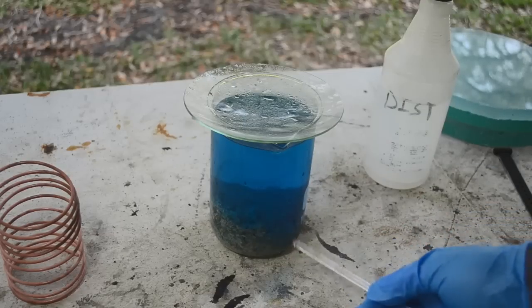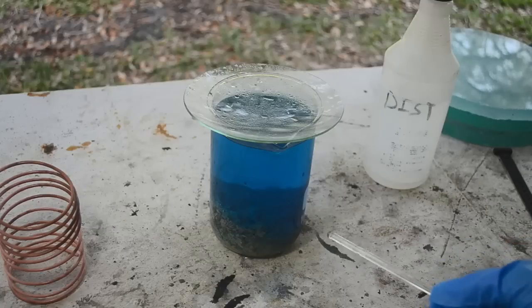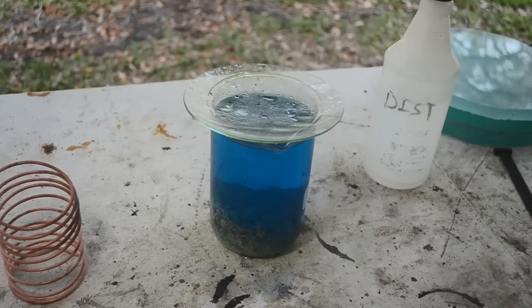So we'll give that a try. We'll divide this in half, and we'll do half with dilute sulfuric acid, and we'll do half with hydrochloric acid, and we'll see which looks like it comes out cleaner. That should be an interesting experiment, I'm thinking.